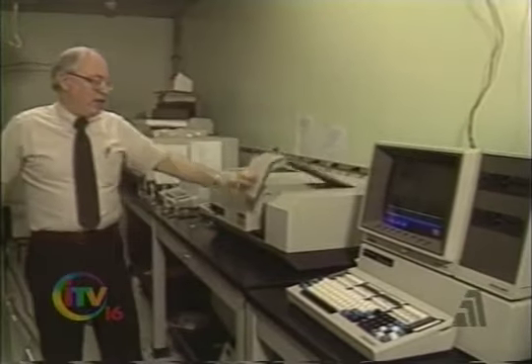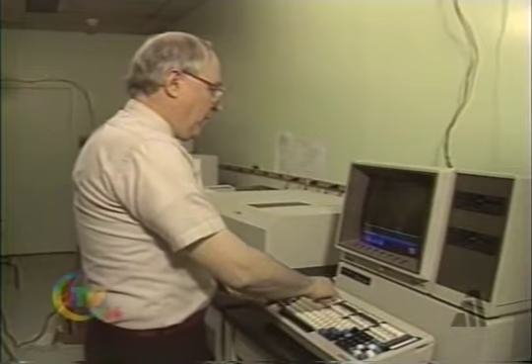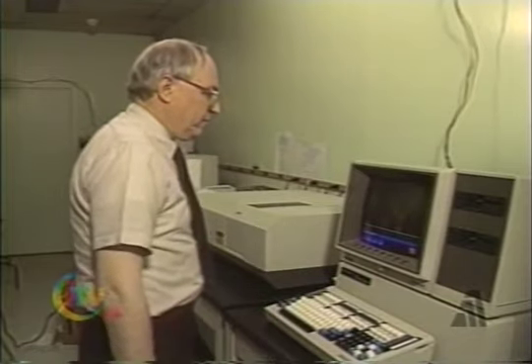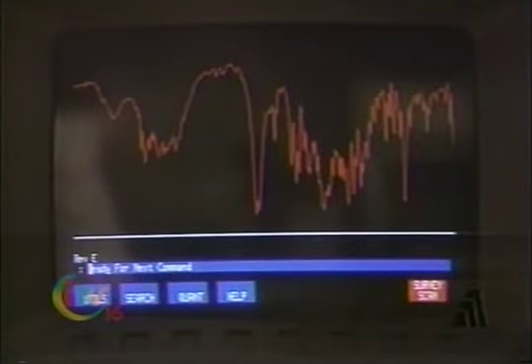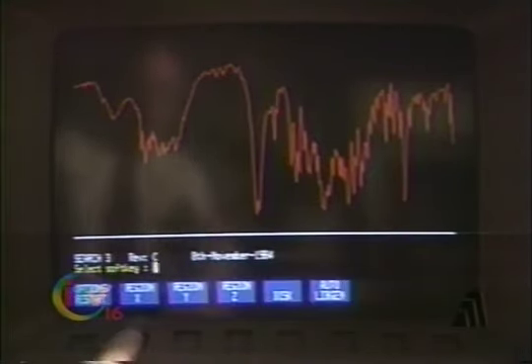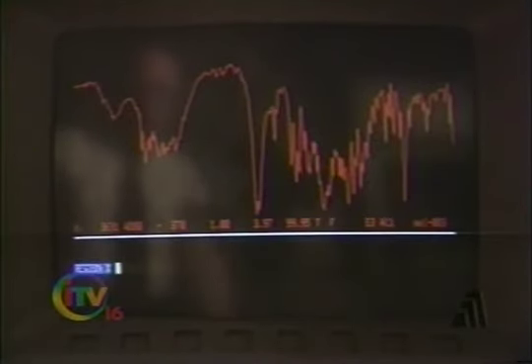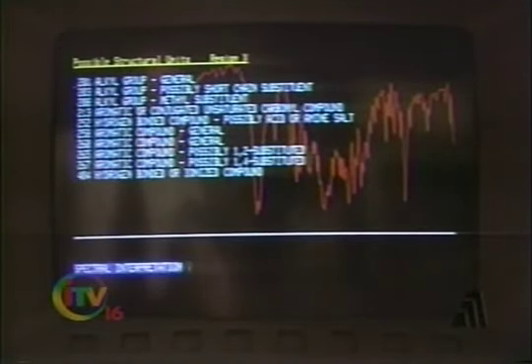Okay. DEA uses a computerized spectrometer. The computer's memory contains a library of infrared spectra of known drugs. The unknown sample is compared with the information in memory for identification. Now we're going to search. An infrared spectrum dips down at the frequencies that are absorbed. The location of these dips or bands tells what chemical structures are present.